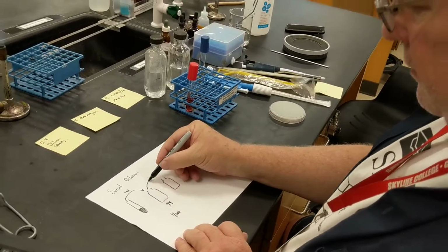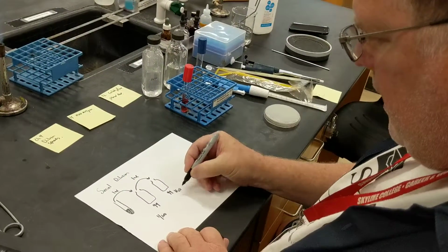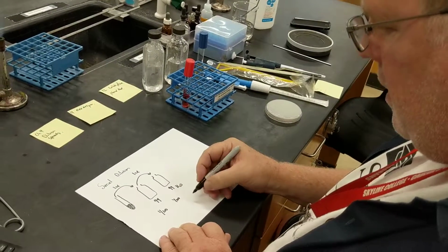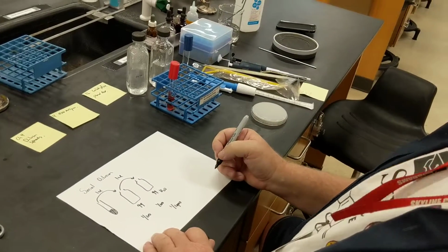We will do that dilution one more time. Again, take that 1 ml, and put it into 99 ml of water, and that is another 1:100 dilution. But in total, it's a 1 to 10,000 dilution.